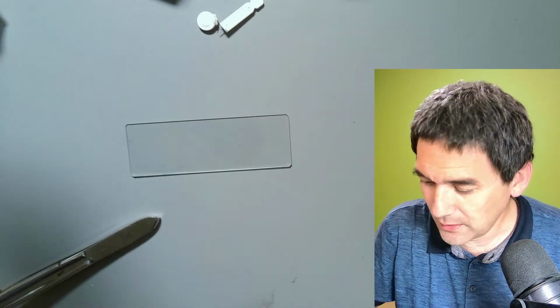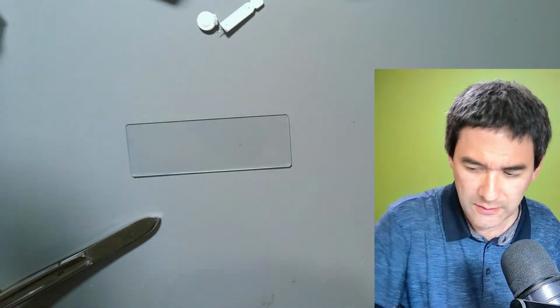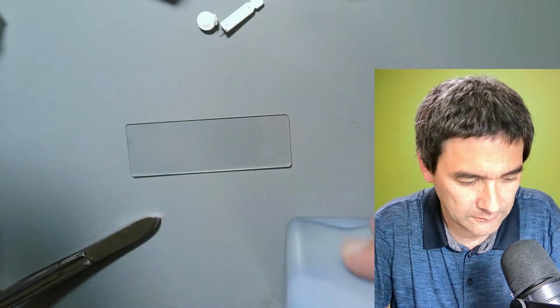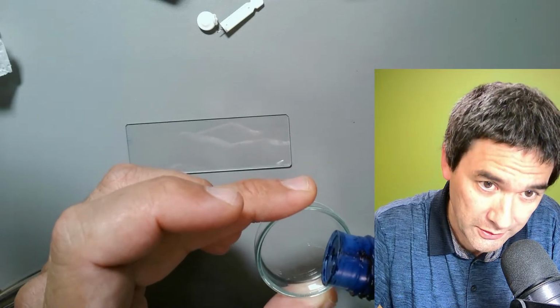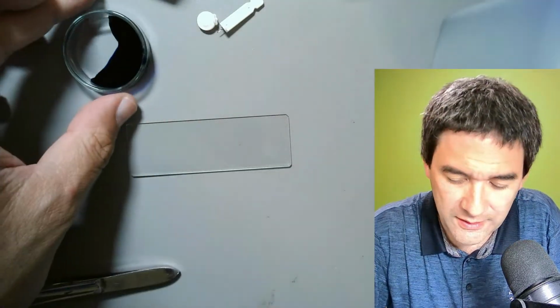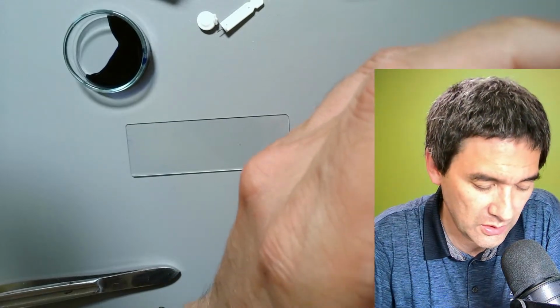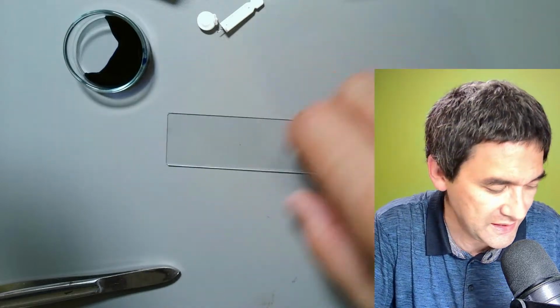Where is a microscope slide? Here it is. You know what? I'm just going to put a little bit of ink out first. I'm a little bit worried that maybe it's going to be a little too dark. Oops, that's a lot. I know that this ink works quite well in staining cheek cells. So I know that it does stain cells, but I've not tried it with blood cells yet.